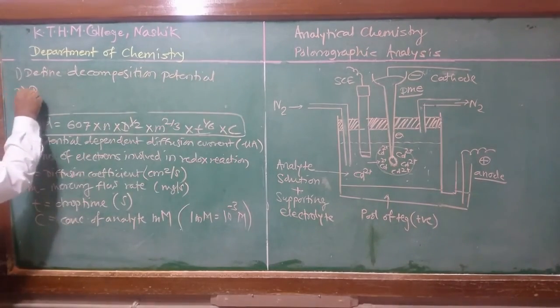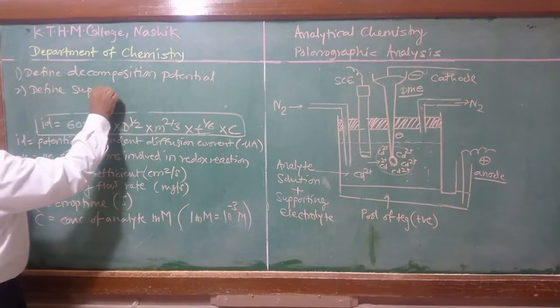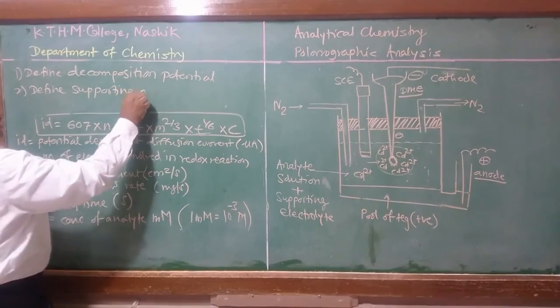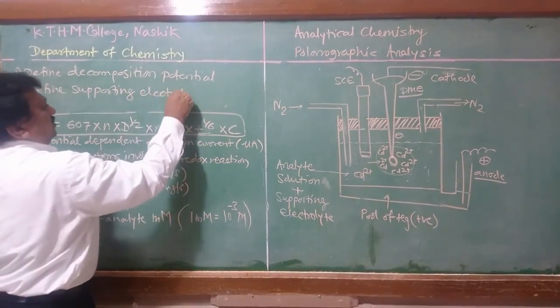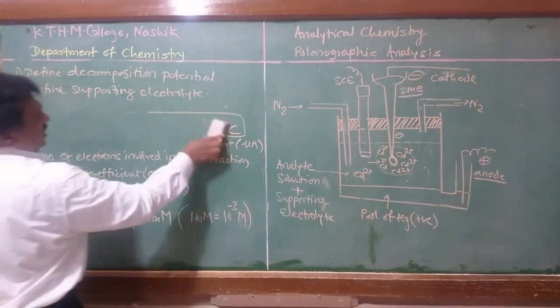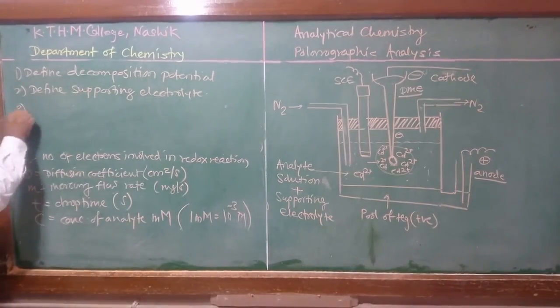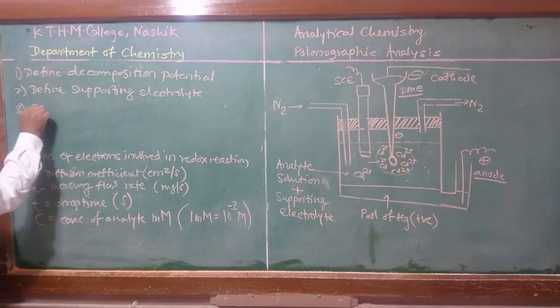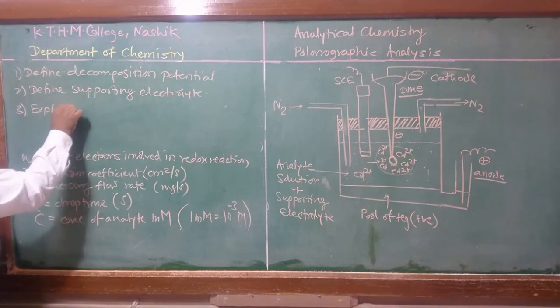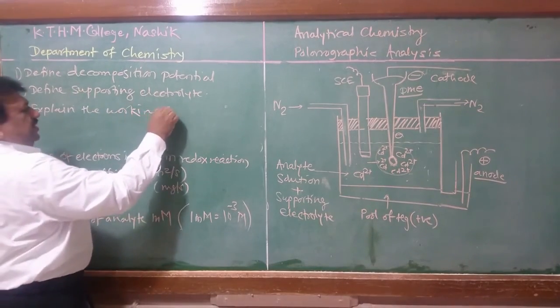Second one, define supporting electrolyte. And third question, explain with suitable example the working of polarography.